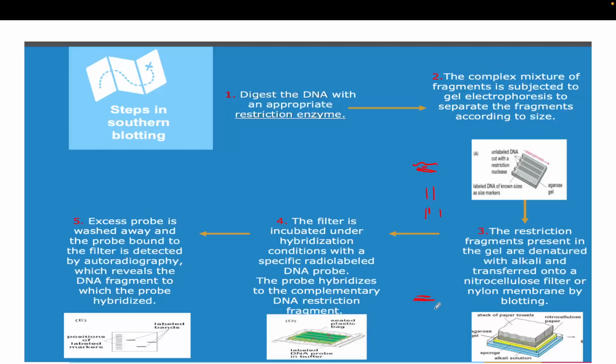In the case of Southern blotting, capillary action happens, so there will be uniformity in the capillary action. If there is any air gap, then the capillary action will not be very good, and it can hamper your transfer process. So we have to look carefully at that when we are doing this type of blotting technique. This is how we organize the Southern blot apparatus.